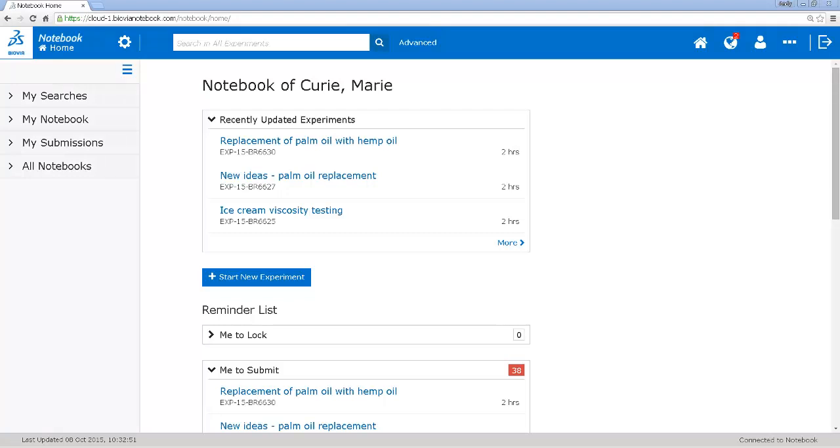I'm a food scientist working on ice cream and I got some ideas to replace palm oil because that may become less available in the future because of environmental concerns. So I need to see if there are any formulations or recipes using palm oil at the moment that I can take and modify with different oils.